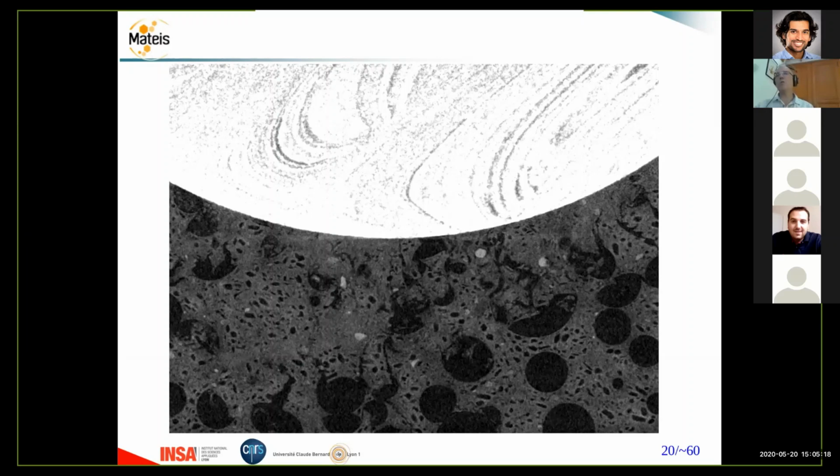The approach that we've used is, for voxel size, we have made the experiment at two different voxel sizes. The same experiment, the same step at two different voxel sizes, to obtain either a very detailed observation like this or a less detailed one like the previous.